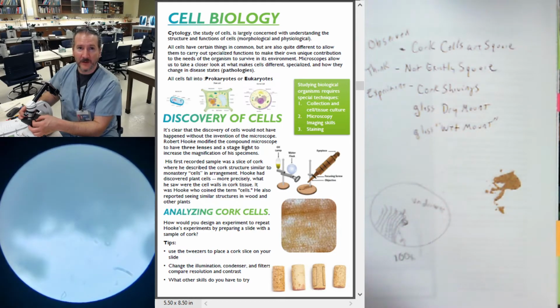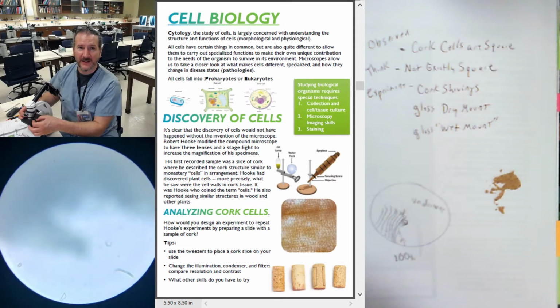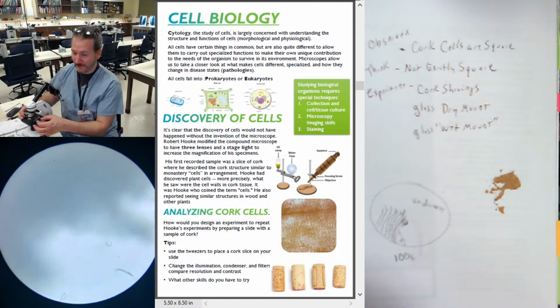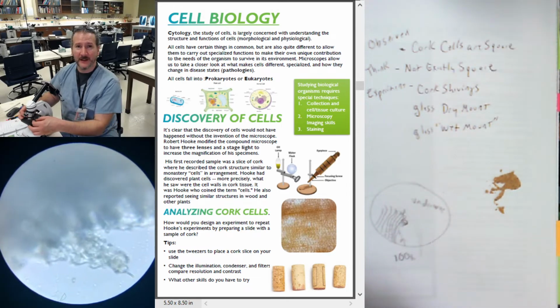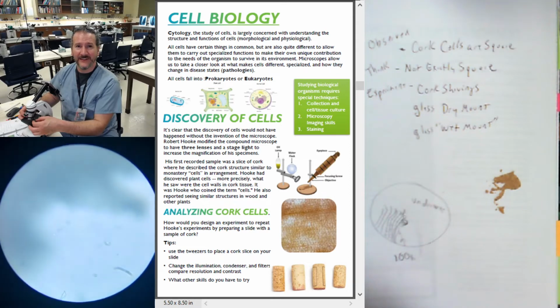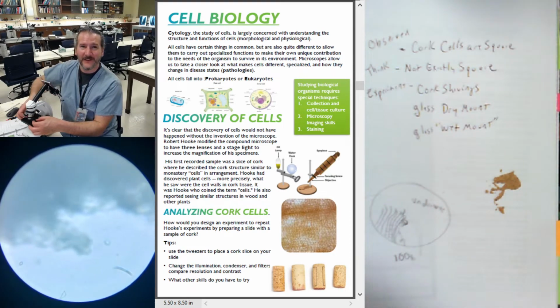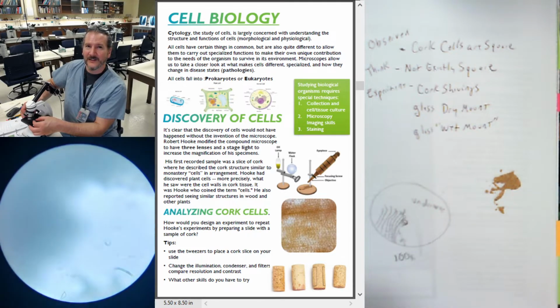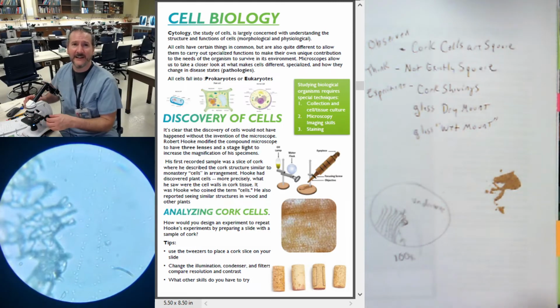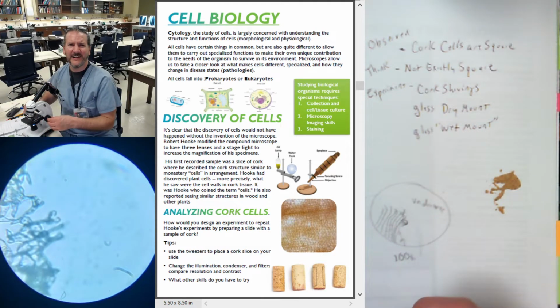Right, I'm gonna follow the hook right down around the corner. I don't want to push too far. I'm at a very high magnification, so remember, if I push a little bit too hard, I'm gonna lose it. And I might be losing it anyway. Can't get my finger over there. Oh no, I think it's gone. I ruined it. Oh, look at that. There it is. That's pretty sweet.